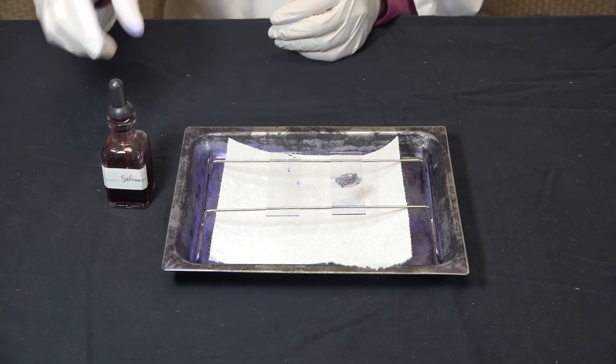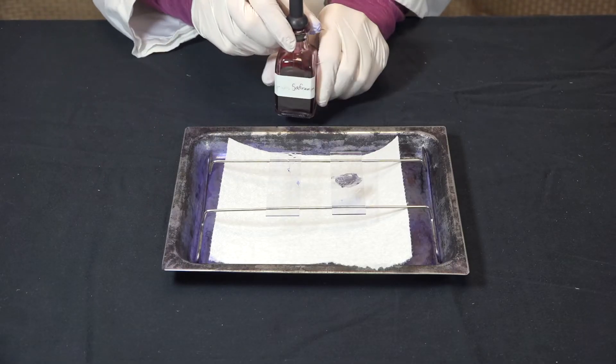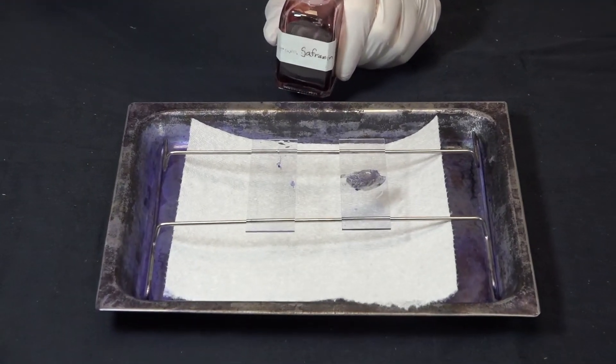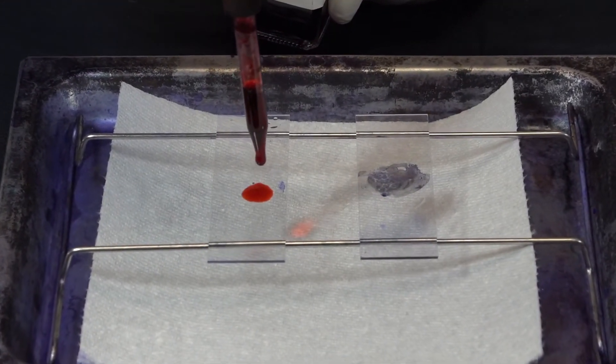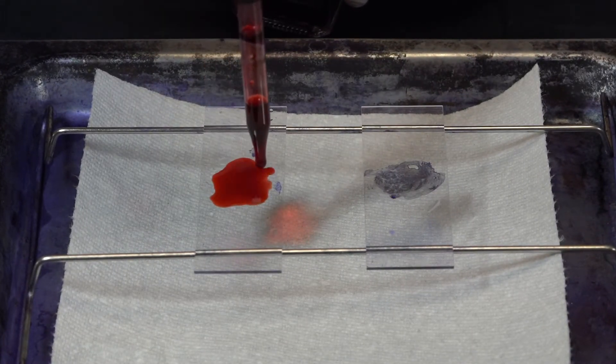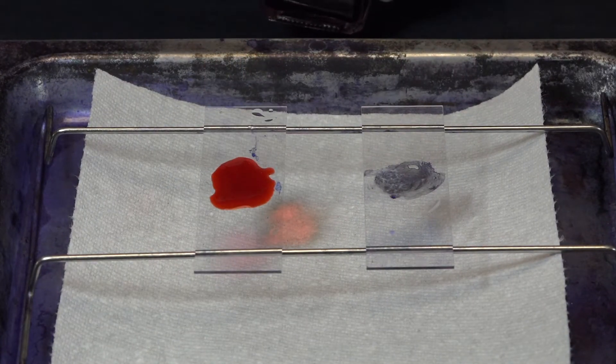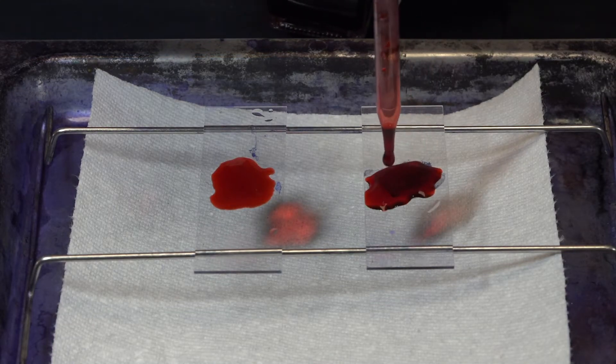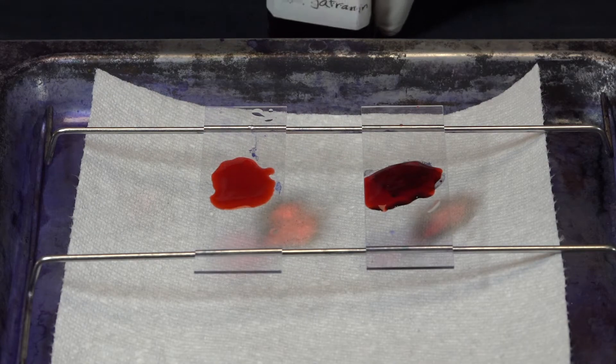Now I'm going to apply our counter stain, safranin. Just like with the primary stain, I'll add enough drops to completely cover the smear. Now I'll wait 60 seconds.